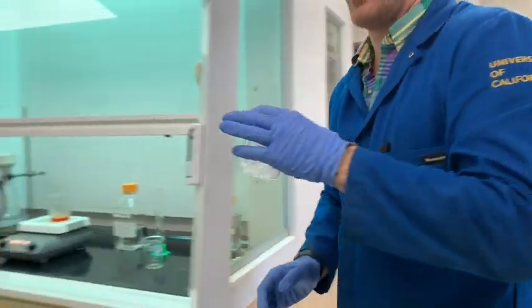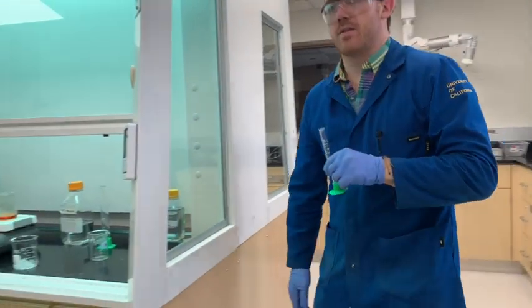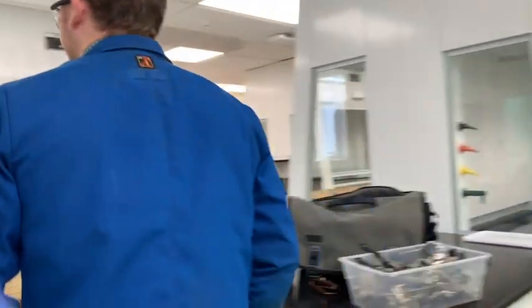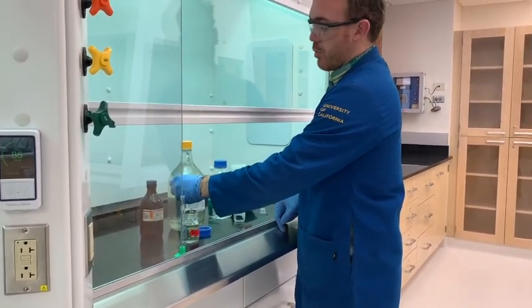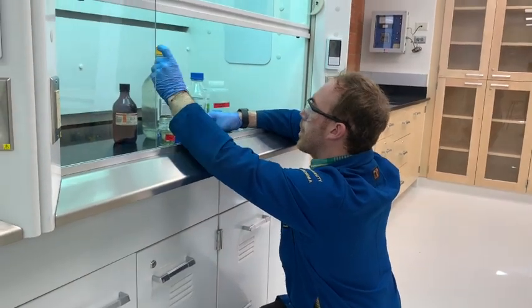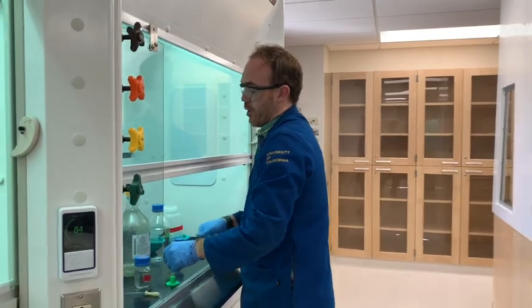All right, next we have to get some concentrated hydrochloric acid. So in order to do that, we're going to have to get one of these graduated cylinders and retrieve that from the hood directly. It's not very safe to keep it in this hood with everything else, so it's over here in the acid hood. So we want 2.5 milliliters here, but if you have a little bit more, a little bit less, it won't matter too much. Just do your best to get as close to 2.5 as you can for consistency's sake. Just going to leave this here. I'll come clean it later. And definitely put the lid back on the hydrochloric acid. It is 12 molar and you do not want to leave it open.